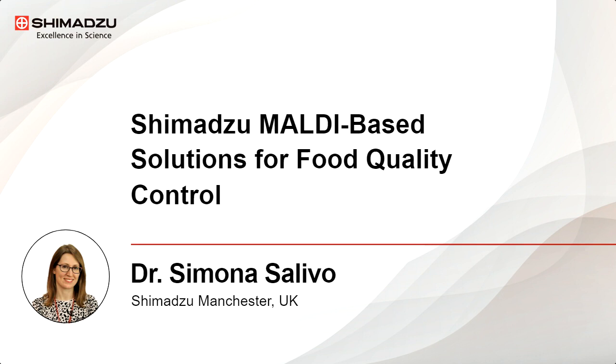Today, I will present some examples of MALDI-TOF MS applications for food quality control. Food is important to everyone, and knowing that what we are consuming is genuine and safe is paramount. So it's key that there are analytical techniques to help ensure this.